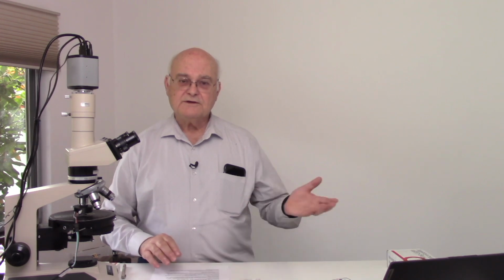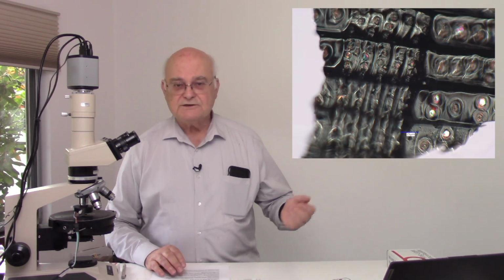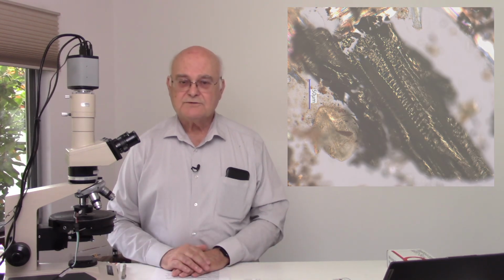So there are a number of different patterns. This cross-field pitting, for instance, in pine, is different than the cross-field pitting in Douglas fir. They're unique structures. And because they're very lignin rich, they tend to char rather than to burn completely, and are stored as part of the plume.